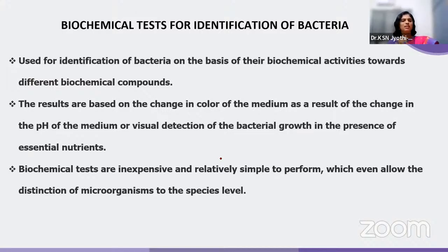We know that bacteria during their life cycle carry out a lot of biochemical processes. And when I give a particular substrate, if there is a biochemical reaction on the substrate, there is a resultant product that is produced. Either the product is colored, or when attached to some other stain, it will give a color. Based on that, I will be able to know whether this particular bacteria has that activity. Therefore, that particular bacteria is causing the disease.